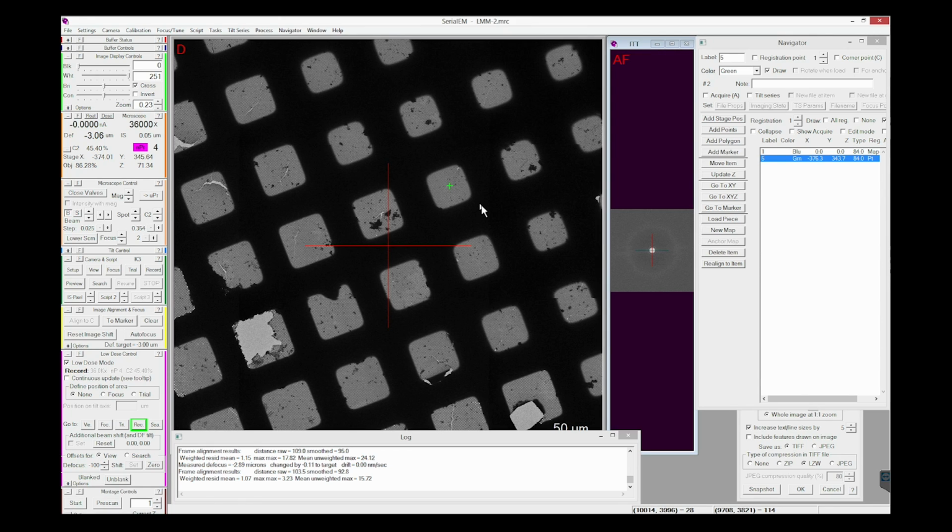And that's because you run the risk of the entire grid square breaking, and then you can't focus, can't take an image, and the program goes haywire. So this broken one, depending on how it looks in this next image, may have some potential.